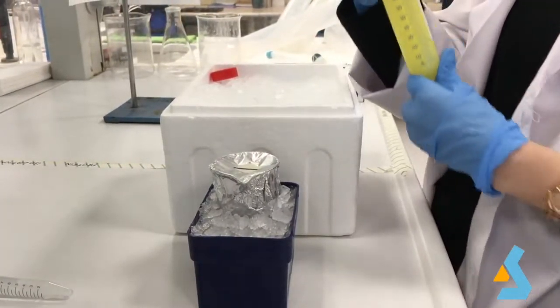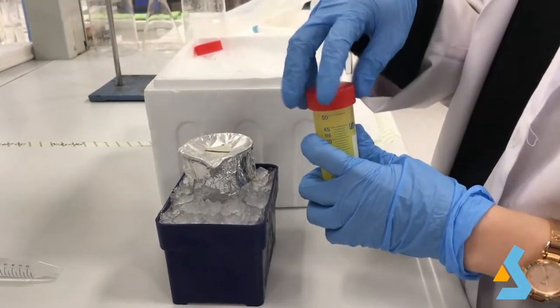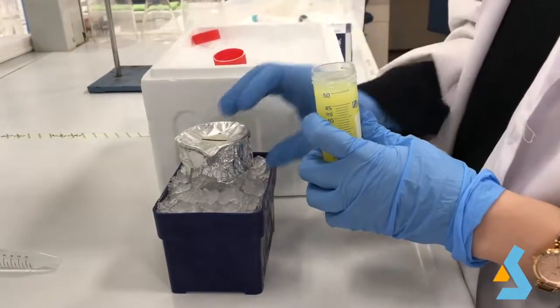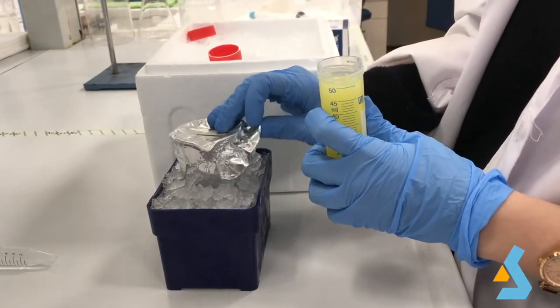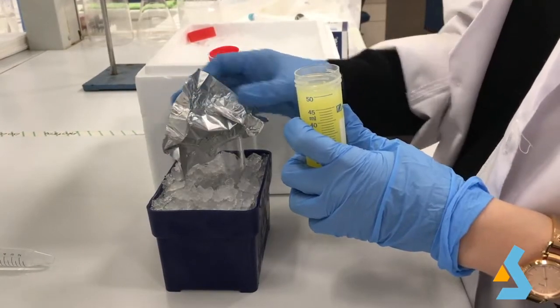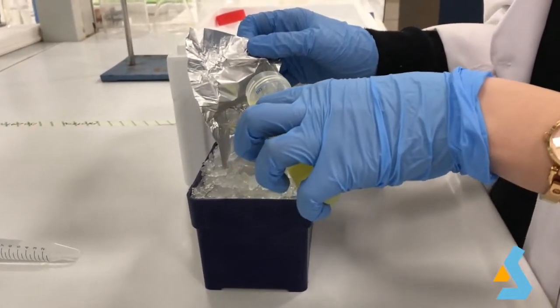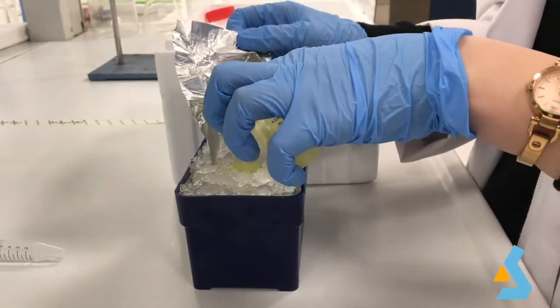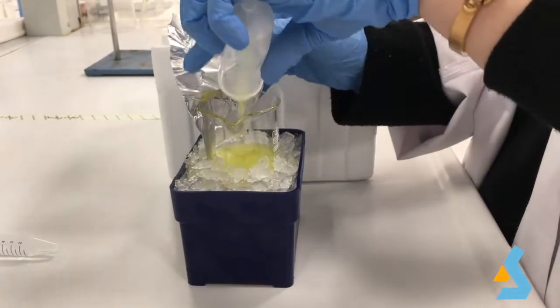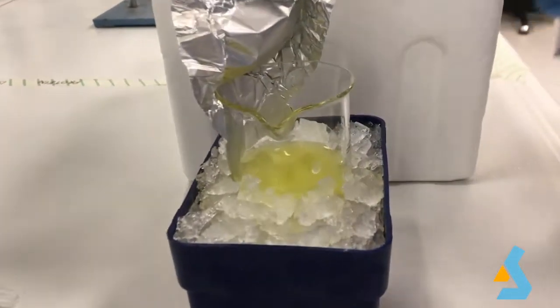Next, we pour the solution into a beaker placed on ice prior to lysis by a probe sonication process. The probe sonicator applies ultrasonic power to the sample, resulting in full destruction of the cell membrane.